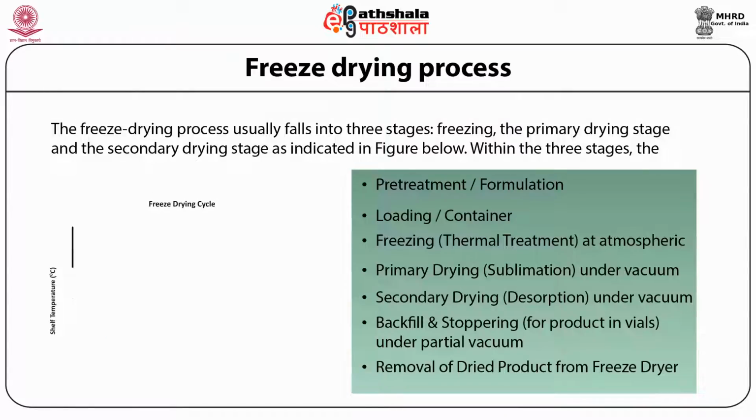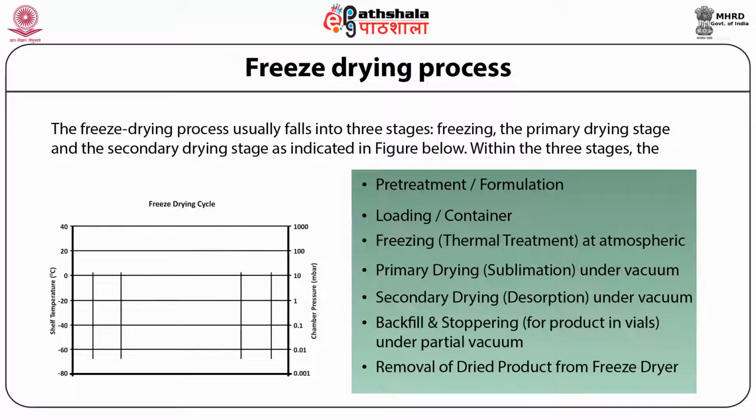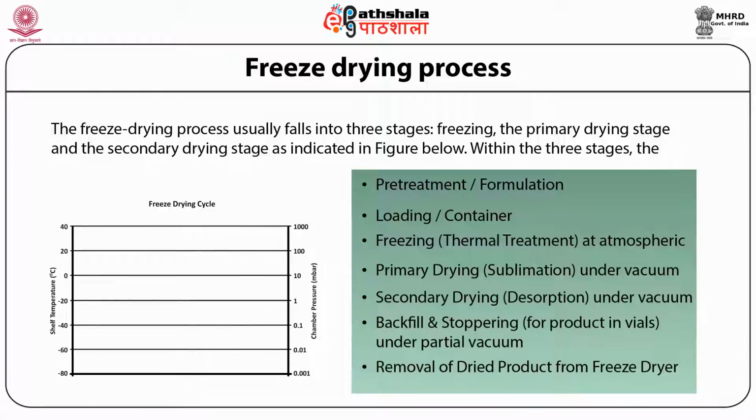The various process variables affect the efficiency of the freeze drying process. The product temperature is a determinant factor for both the productivity and the product quality. This is because sublimation is generally faster at higher temperature, but drying at excessive temperature results in a loss of the pore structure, which is defined as the collapse phenomenon, and might result in rejection of the batch.